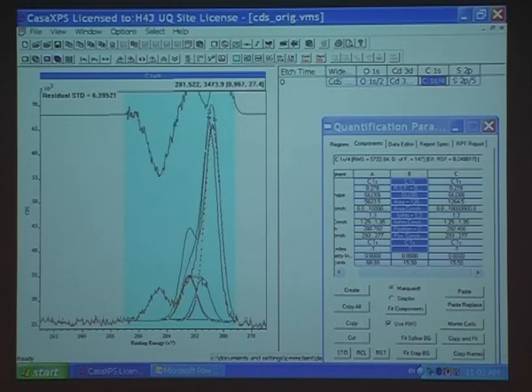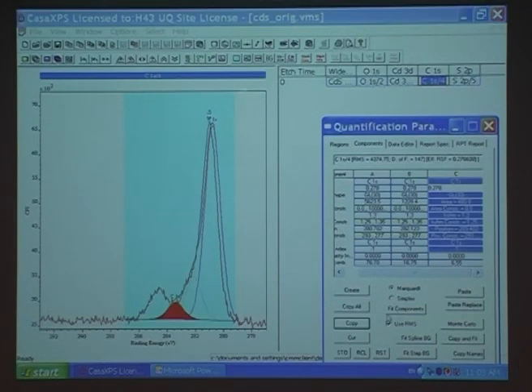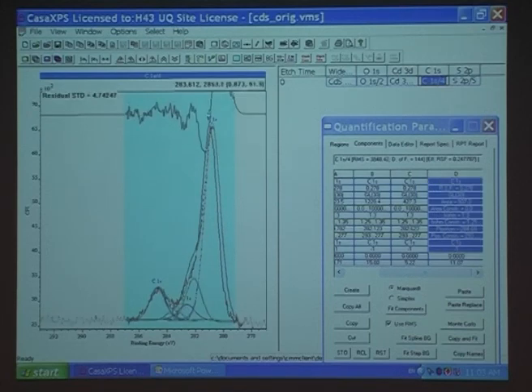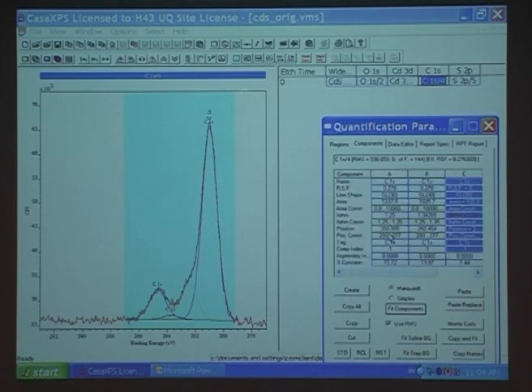As I said, I'm not too concerned about solving it. I just want to get a reasonable fit. This one, copy and paste. So I think there's four carbons there, and it looks very much like typical junk. And then I go fit. This one's very small. Okay? I could even get rid of it if I wanted to. But what we're mainly after is the position of this peak, which is 280 point, nearly 281.